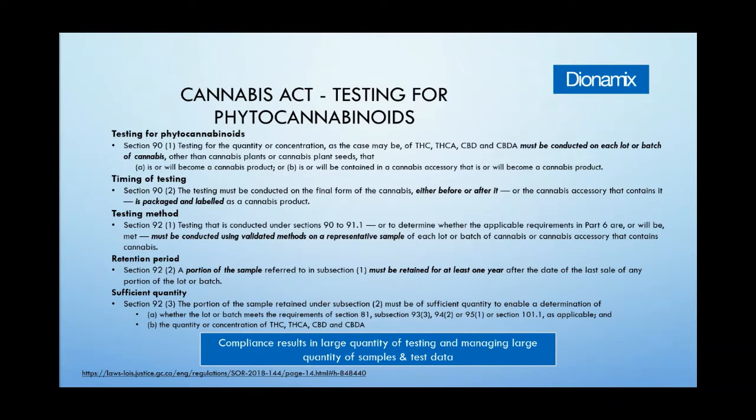There are a lot of details in the Canadian Cannabis Act. To be in compliance will mean testing a lot of samples and retaining the test data for a period of time. The challenge becomes using the test data not only for compliance, but also how to drive productivity and sales.